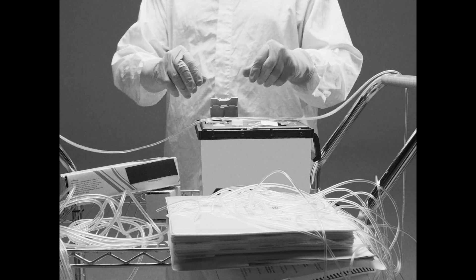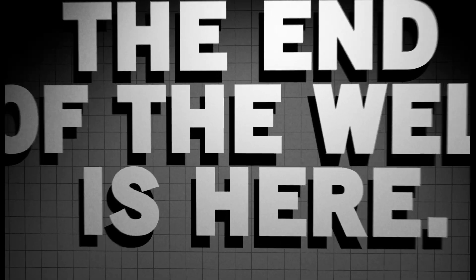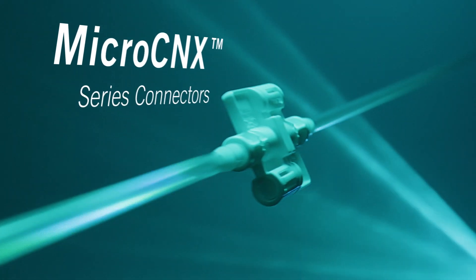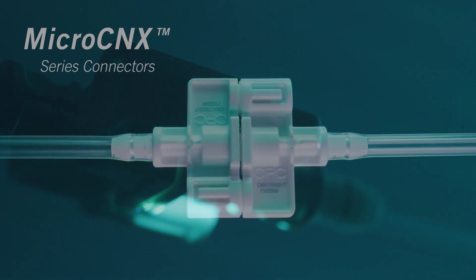CPC, your trusted leader in single-use connections, has some exciting news. The end of the weld is here, and it's smaller than you might think. Introducing MicroConnect Series Connectors, the small, aseptic, single-use connectors and the most efficient alternative to tube welding.